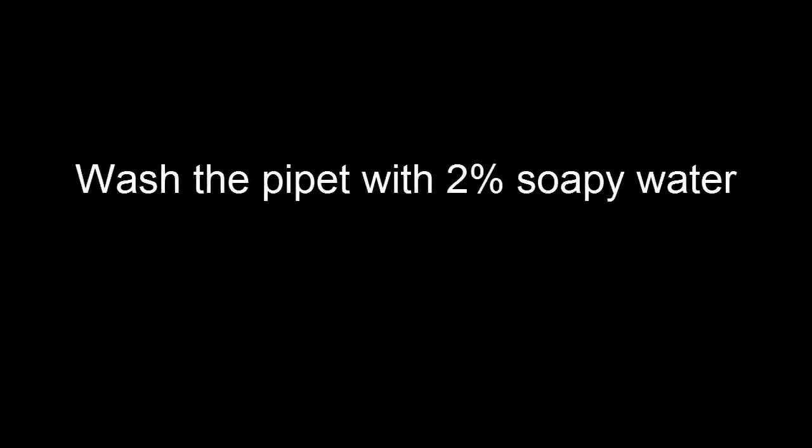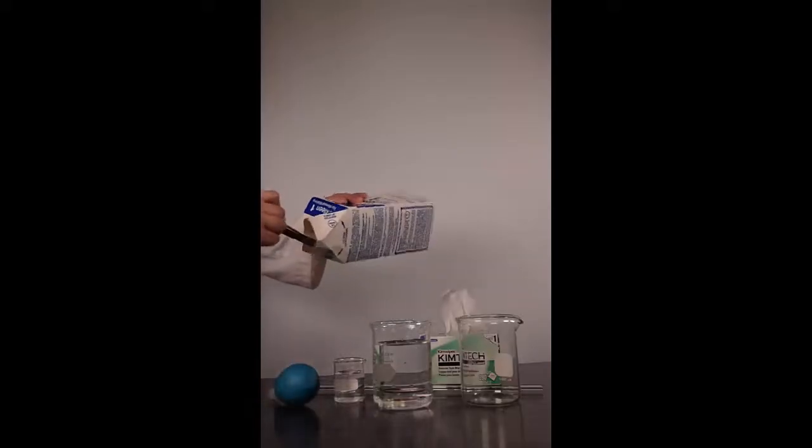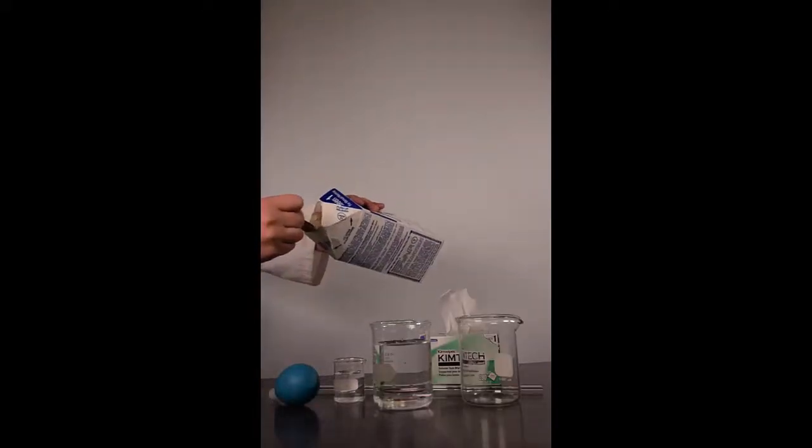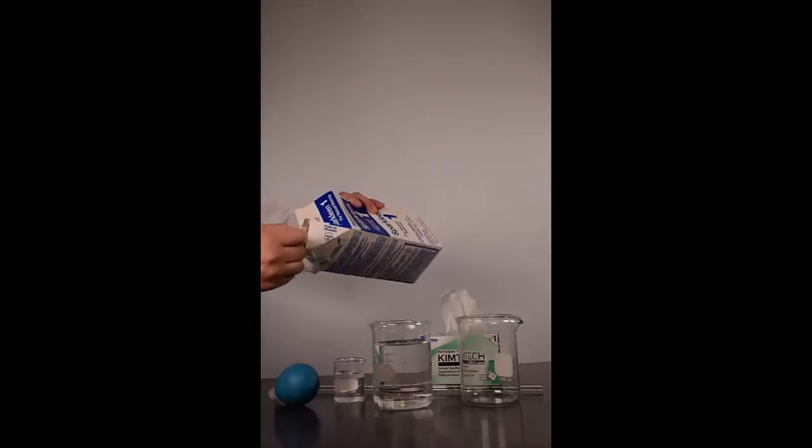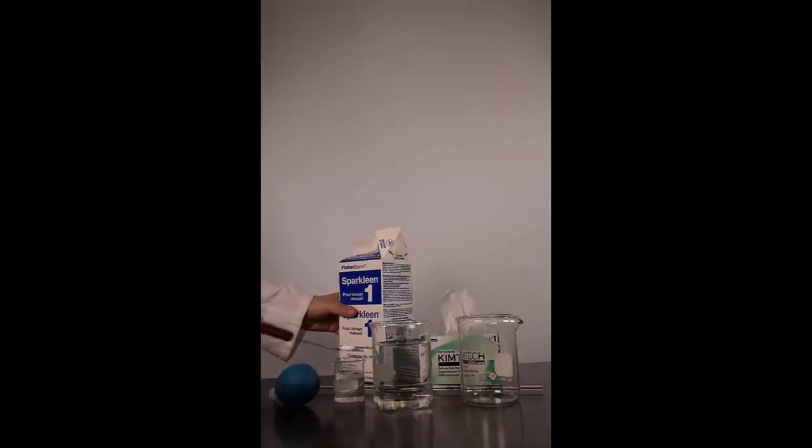To clean a dirty pipette, wash it with a 2% solution of soapy water. Dissolve a small amount of detergent into warm water. Using too much soap will make it difficult to rinse the soap from your pipette, contaminating it further.